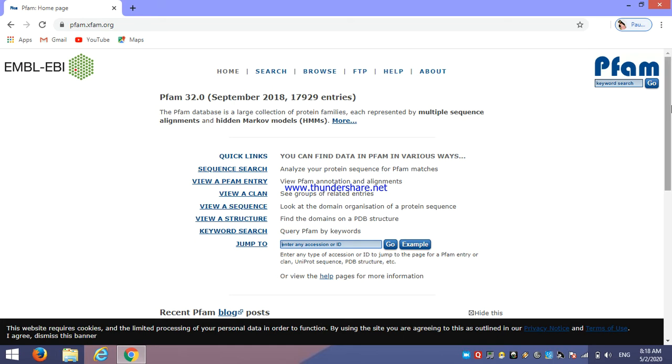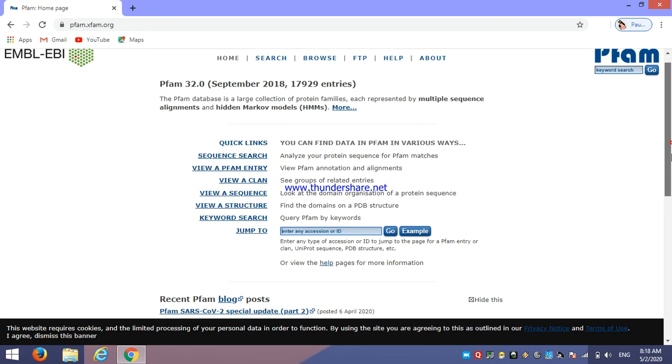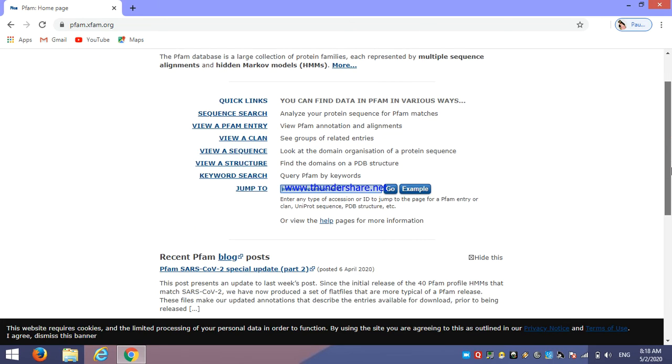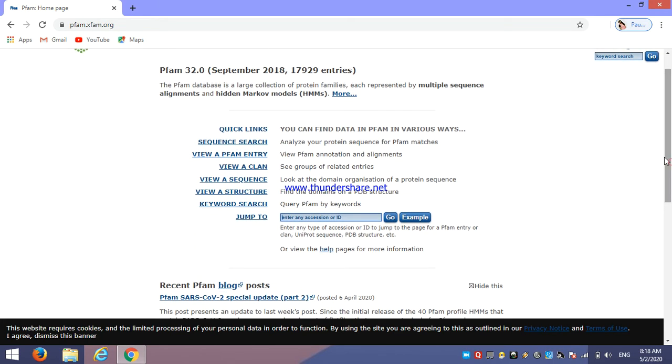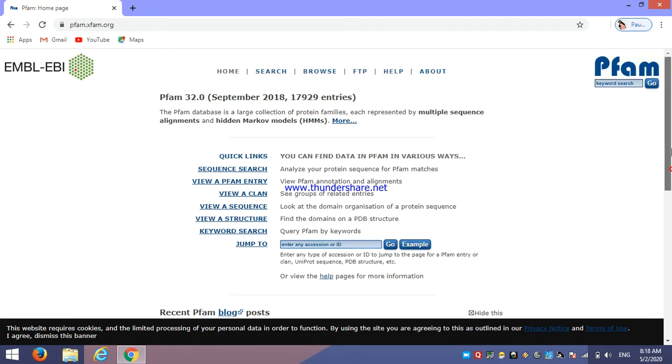For this, we need any accession ID of any particular protein which we want to study the family. And in other databases, we need some FASTA formats, but in this we need accession ID which can be retrieved from UniProt sequence or any other PDBs, PDB-like databases of protein.